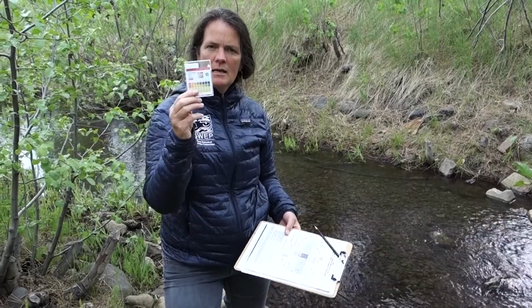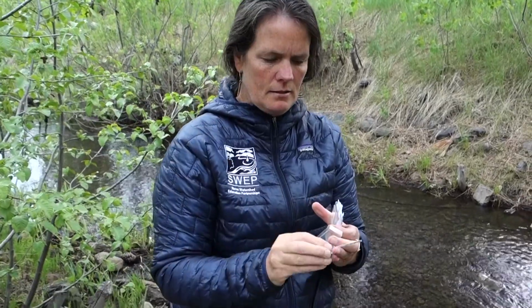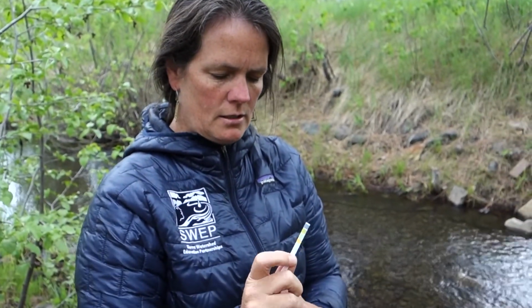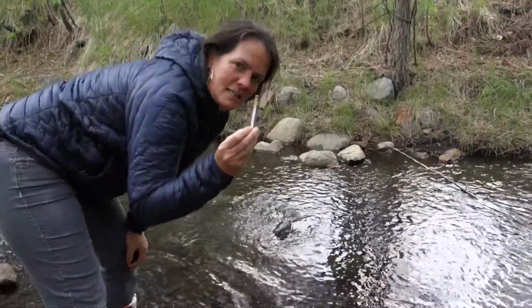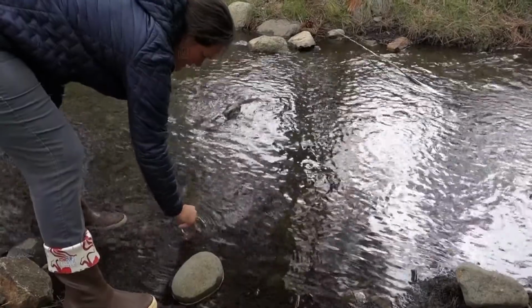So the way we're going to do that is using these handy dandy pH strips. I'm going to pull out one pH strip, and you can see that they have these 4 different little color squares, and those will change color when they react with the creek water. So you're going to take the pH strip and just swirl it in the water for a few seconds.